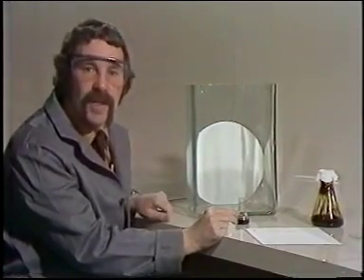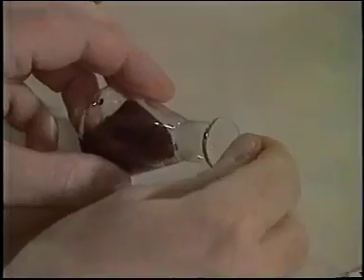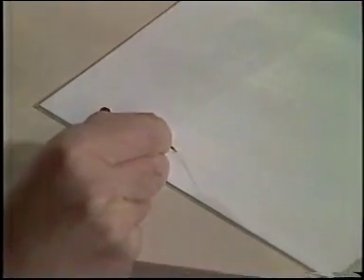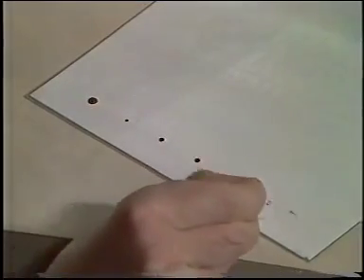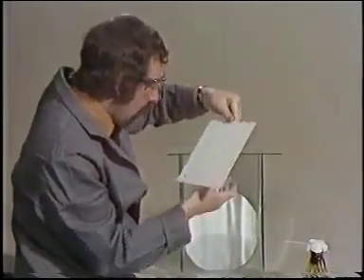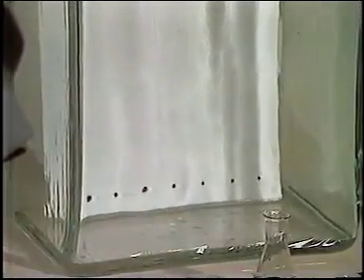First of all, we have to find out what there is in the mixture, and for this we use thin layer chromatography. I've dissolved up some of the tar in a volatile solvent, and using this miniature pipette, I apply spots of solution to the surface of the plate. The solvent soon evaporates, and the plate is placed gently in the chromatography tank.